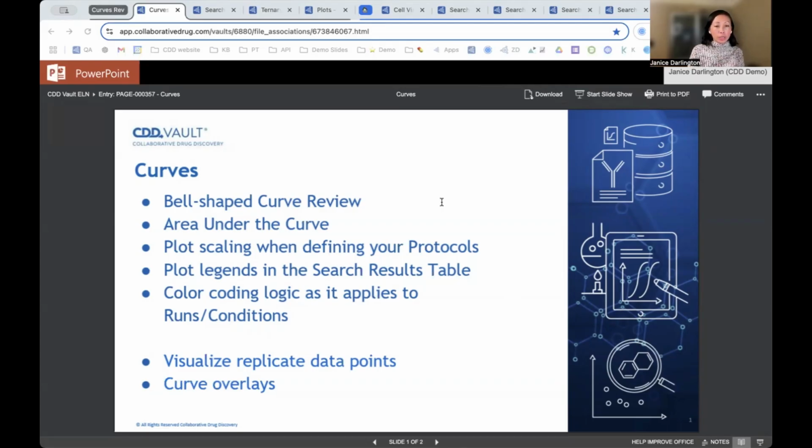What I hope to give to you is a sense for how CDD Vault plays an even more crucial role in collaborative communication with these add-on functionalities. Instead of working within the confines of data that stay static, there's flexibility to apply new knowledge to the data that remains fact with efficient tools at your fingertips in this one single platform.